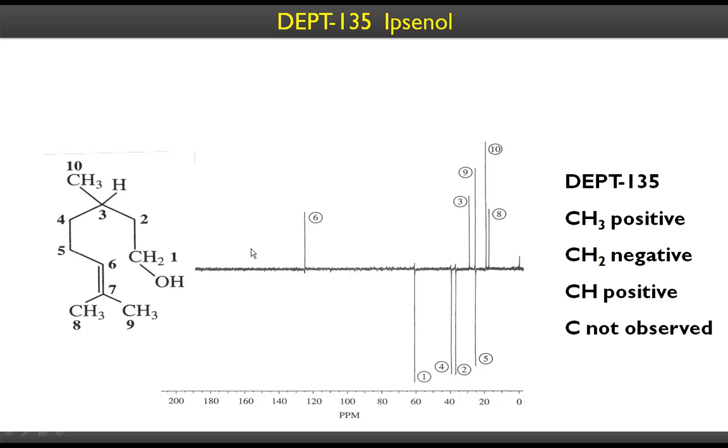So that is what, 3, so that is that methine. And how do we know that? Because there are only 3 methyls, 1, 2, 3. Leaving those 3 methyls, there is one more peak, and that must be a methine, because only methines and methyls give the positive peaks, whereas all the negative peaks are methylenes. We have different types of methylenes.